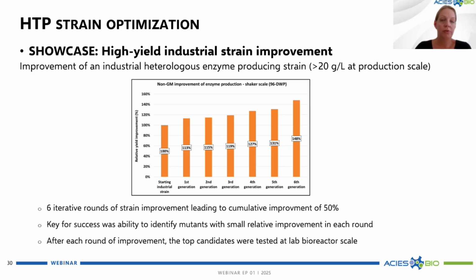So this already happens naturally, but we can also speed it up with the addition of mutagenesis at the beginning, and you already introduce a mutagenized culture into the ALE, and you don't have to wait for the mutations to happen. You already have them present at the start.